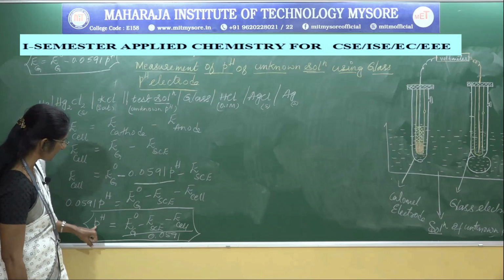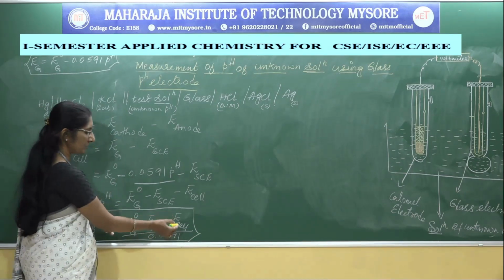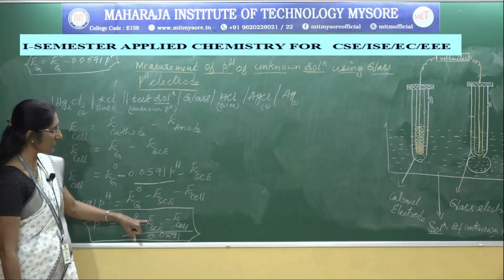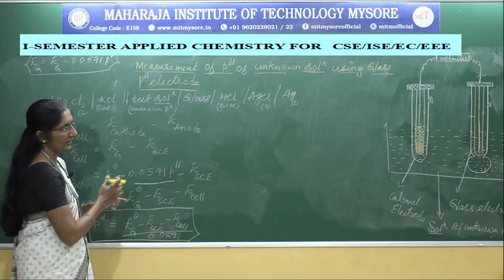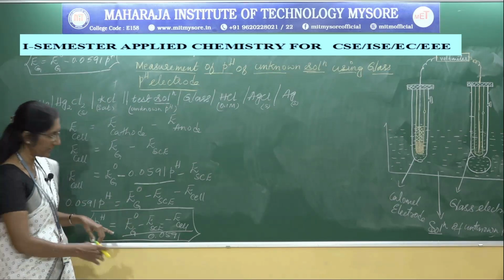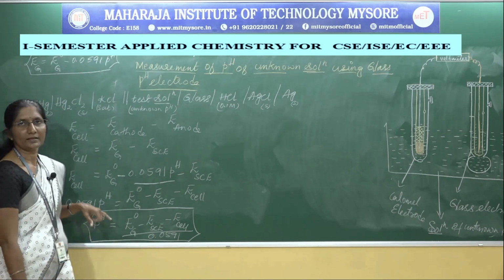The E cell value is obtained from the voltmeter, then E saturated calomel electrode is known to us, its value is 0.2422. Then the E naught G value is calculated by placing this galvanic cell assembly in a buffer solution of known pH. By substituting all these values and dividing by 0.0591, we can easily calculate the pH of a given unknown solution.